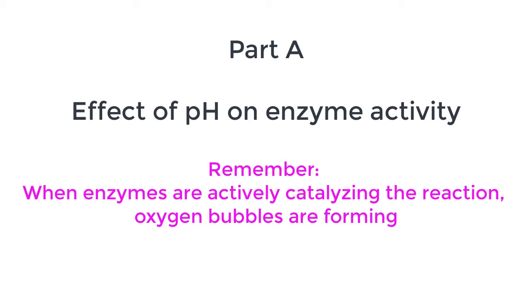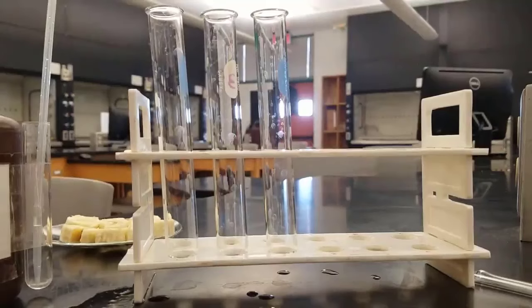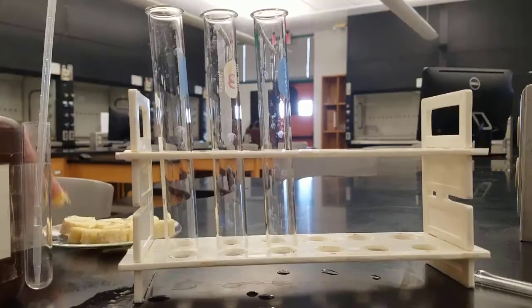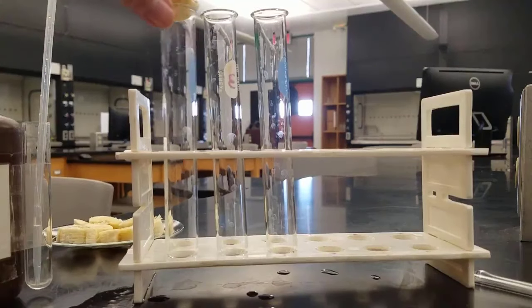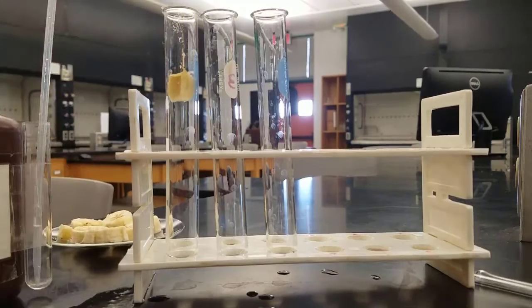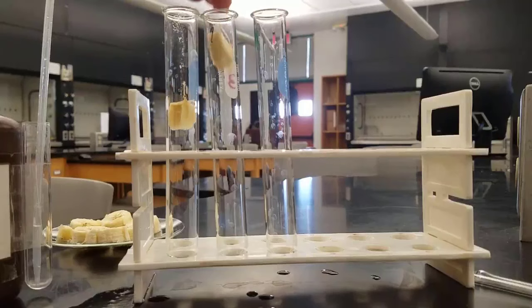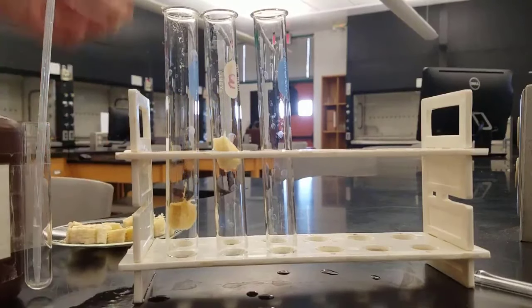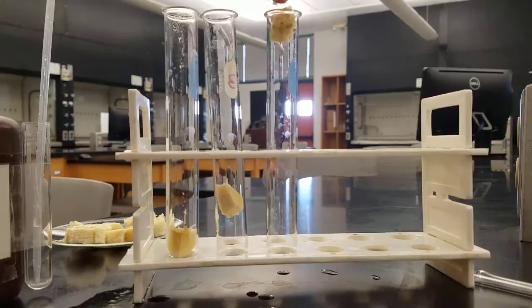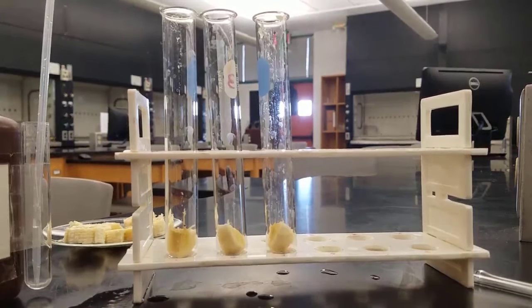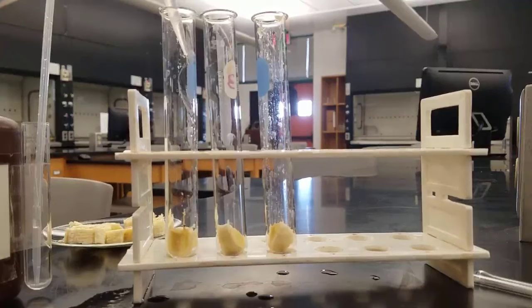In Part A we're going to look at the effect of pH on enzyme activity. Just a reminder that bubbles will show us that our enzyme is active. To start with, we've cut up the banana into roughly equal sized chunks. We want to control as many variables as possible, so we are using the same size banana and the same size test tubes for each of these.